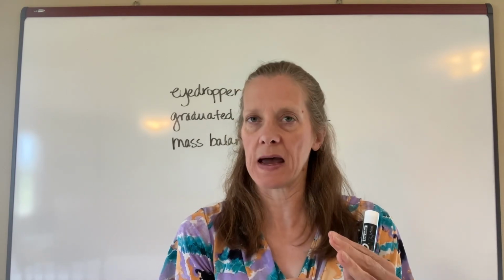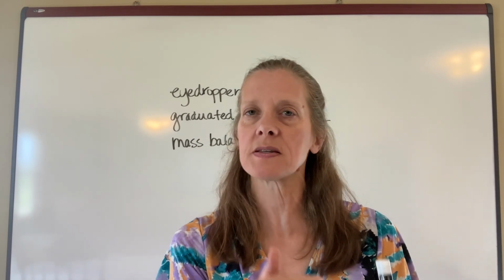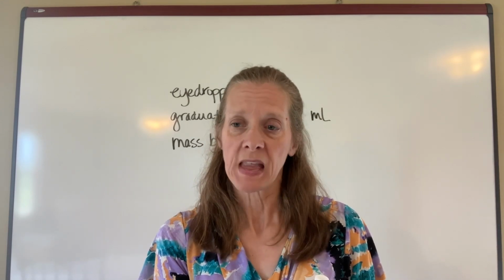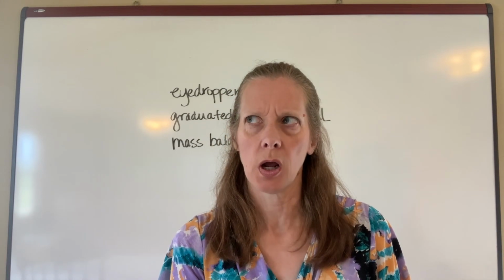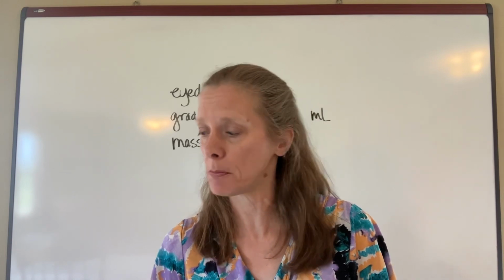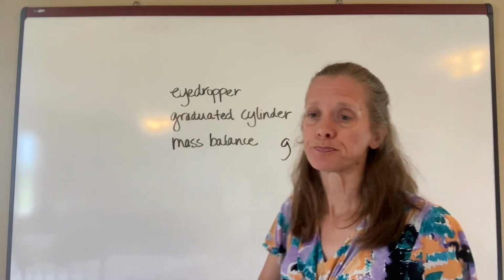If you were trying to add exactly 20 milliliters that you were going to use in a titration, how exactly did you get it so that it was as precise a volume measurement as you could possibly do? You could even pull your old book out and go, what was I doing there with an eyedropper and a graduated cylinder to try to measure my volumes exceedingly accurately? Because we're going to have to do some very precise measurement when we're talking about molecules, right?